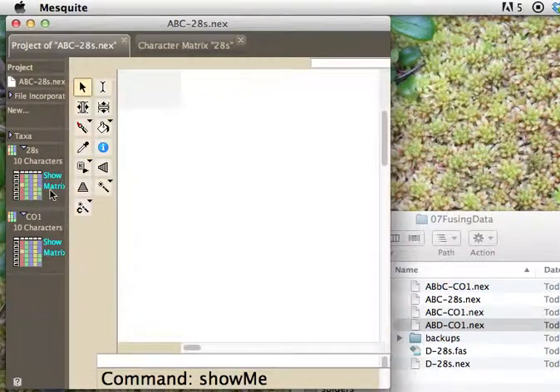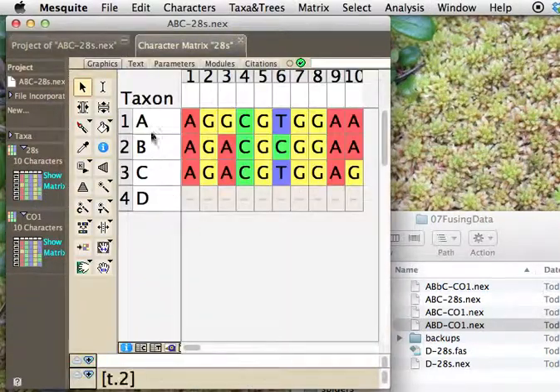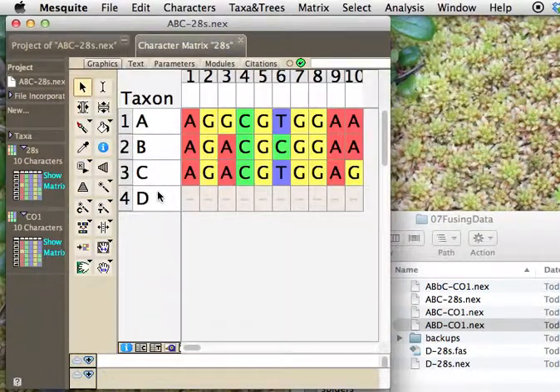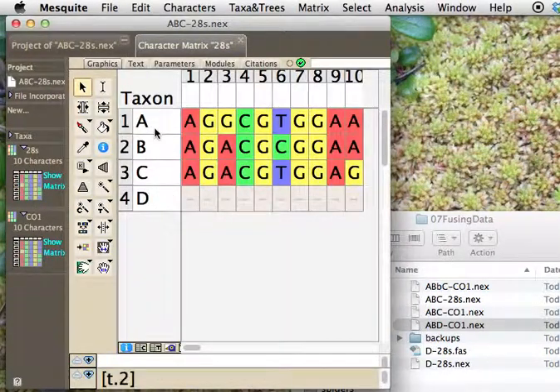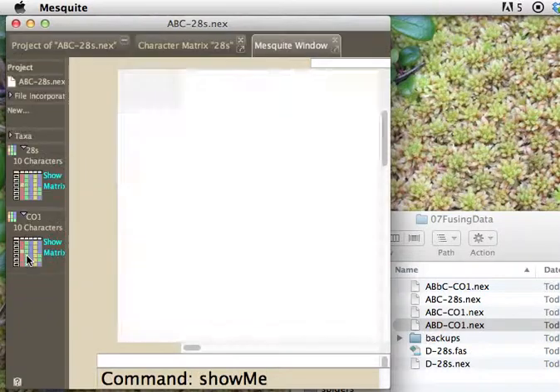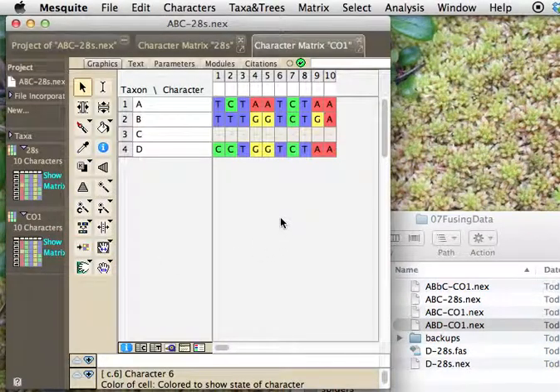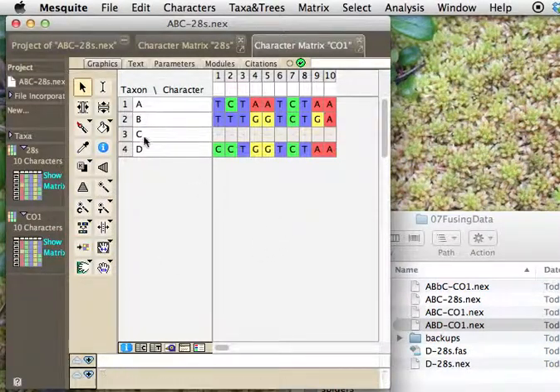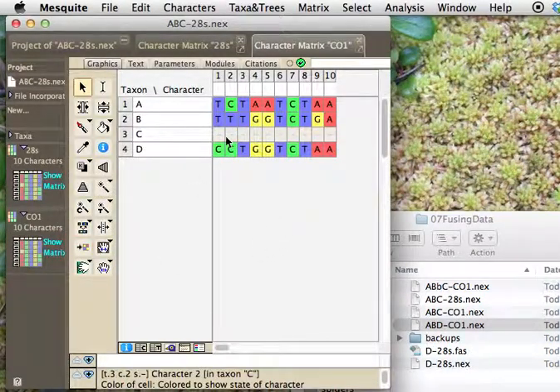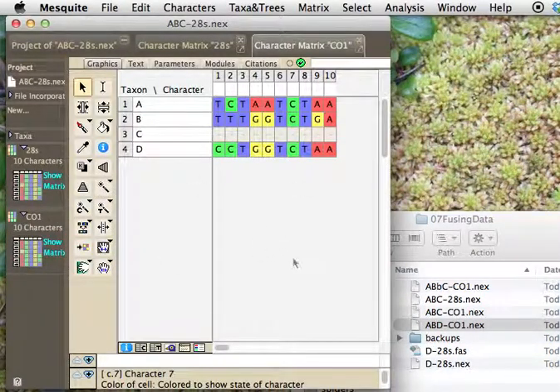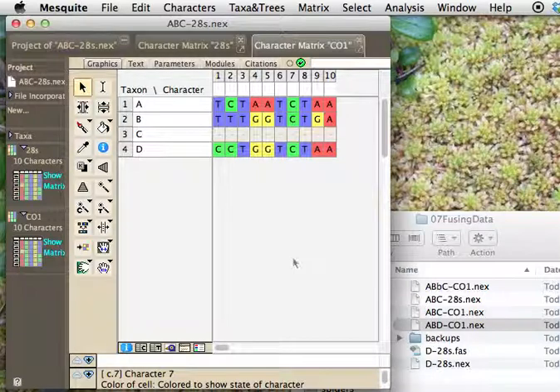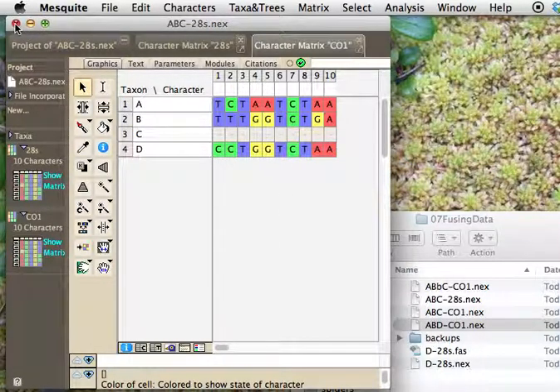And if we look at either one of them, we see in fact here's 28S, it has the A, B, and C that we had before. Here's CO1 that has A, B, and D, and it doesn't have the C. So we successfully blended them in. That's all great.